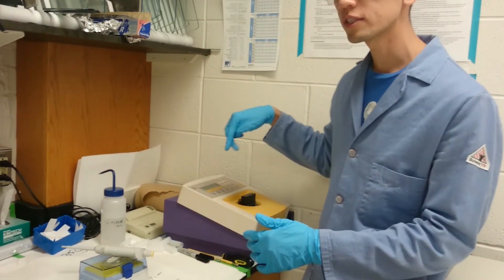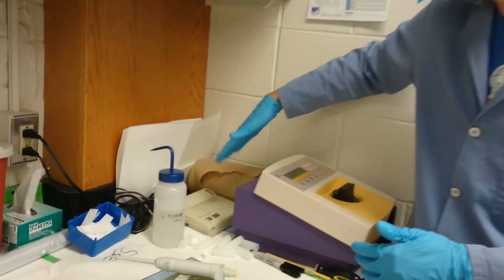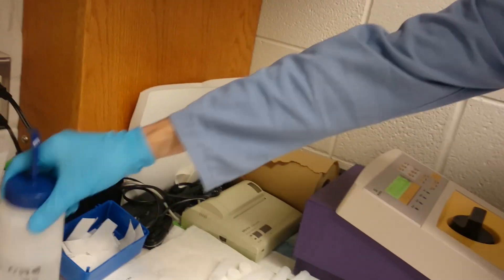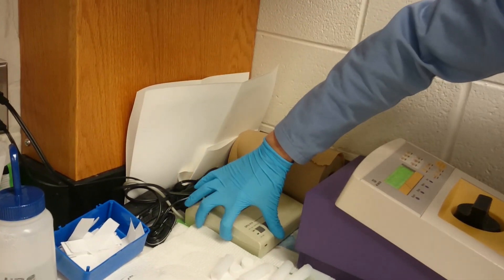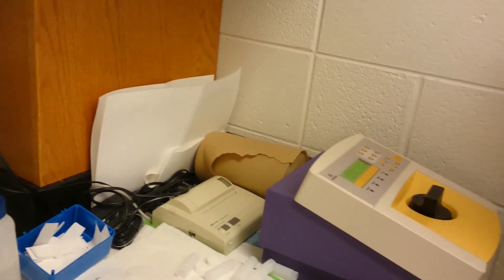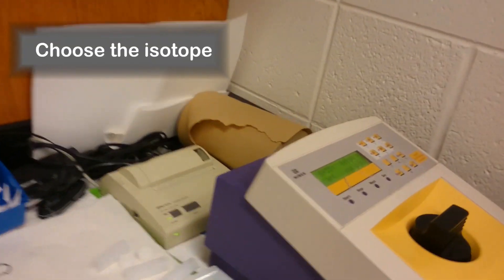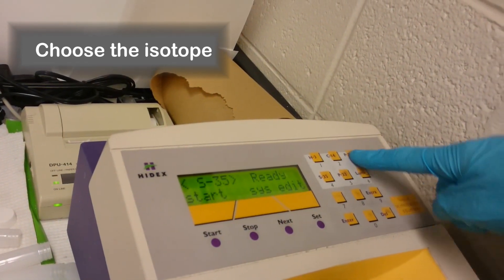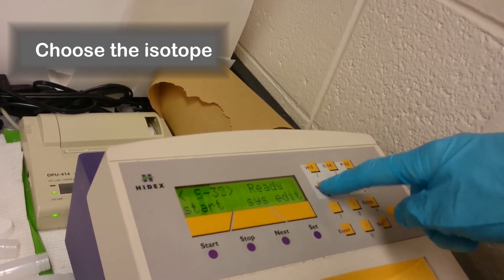There are two power switches for this one. The scintillation counter itself is in the back on the right, and then there's a second power switch here for the printer. If it's not already on the isotope that you want, you just choose by pressing the correct button and it should switch back and forth.